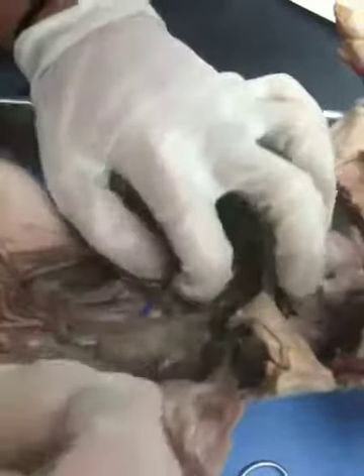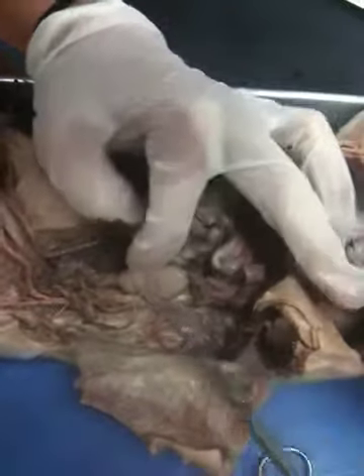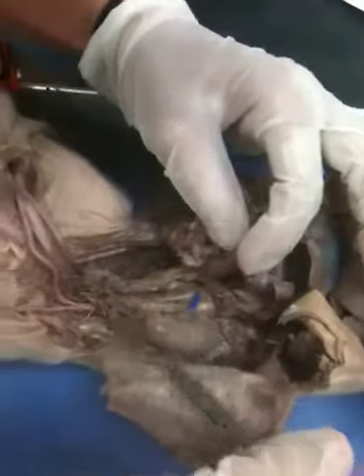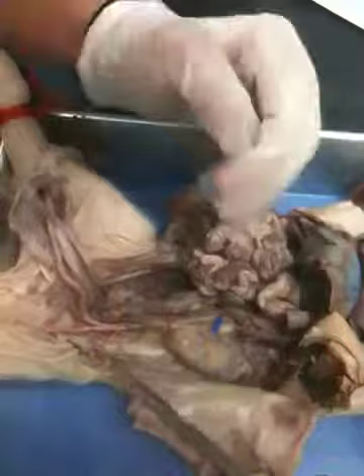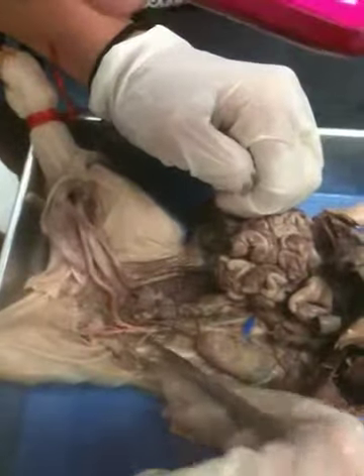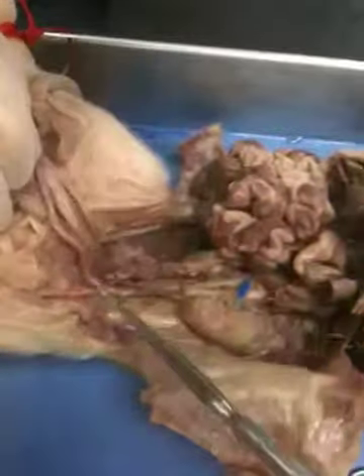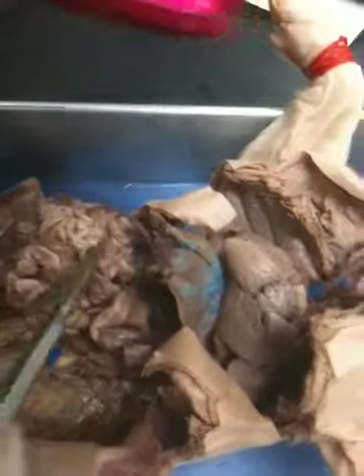The adrenolumbar vein, same place where the adrenolumbar artery is. The renal vein, also going into the kidney. We don't have the gonadal vein. Ours broke off, so. Iliolumbar, you can kind of see it. The blue part. The umbilical vein is what was cut right here. This one and that part.